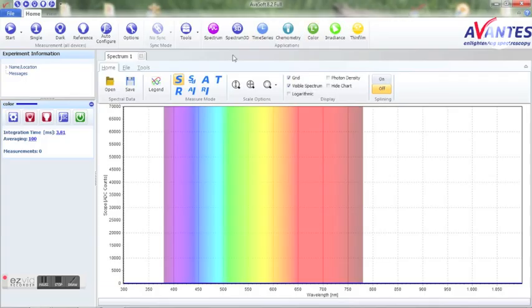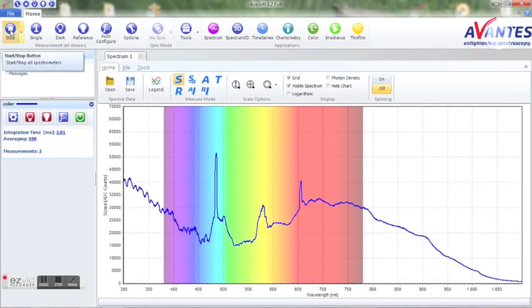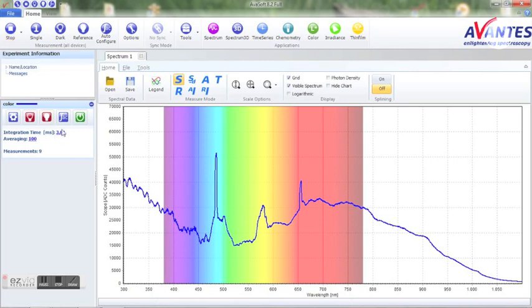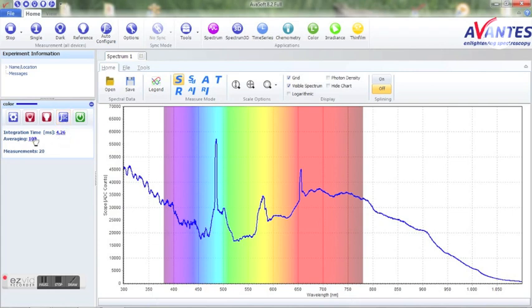First we'll start Avasoft and go to the scope screen to set up the desired parameters to make a decent measurement. We are now ready to perform measurements on the sample. For this demo, we assume you want to store transmission data in time.